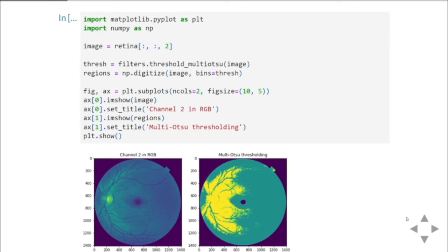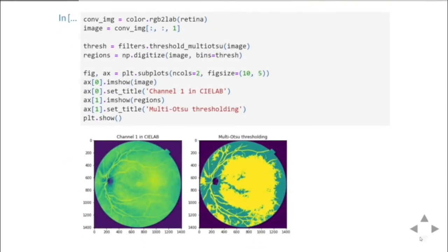Yet, if we simply change color spaces, going from RGB to CIE lab in this example, we can see that the same thresholding applied on the first channel does yield the desired segmentation. Of course, it would take other and further filtering steps to smooth the boundaries of the thresholded regions. Then you would typically label the different regions and measure some properties for them, such as their size or the position of their centroid. You will see that these utilities for labeling and measuring region properties come into play in the material science application, which Gus is going to present right now.